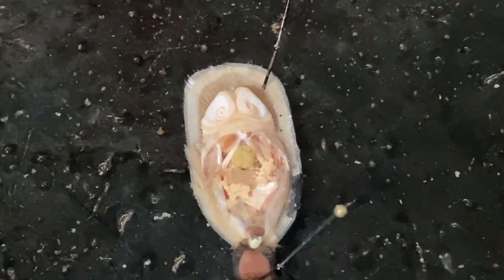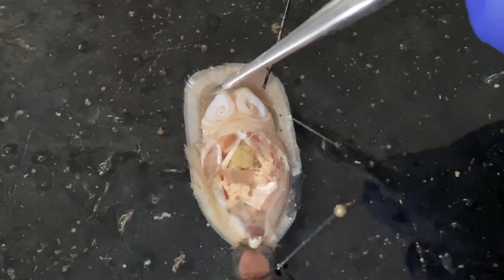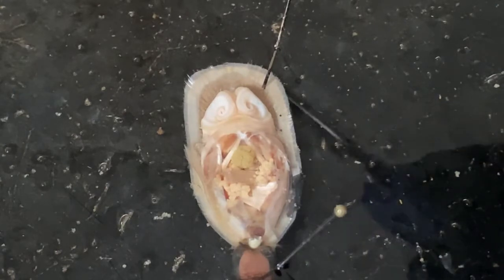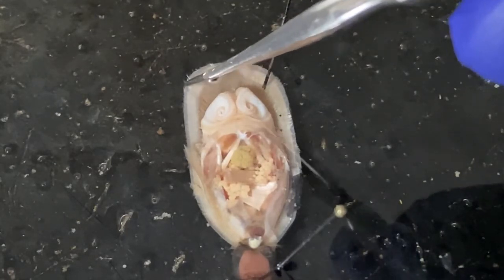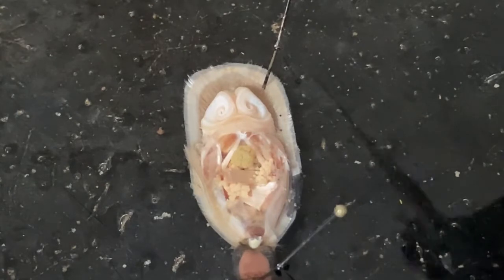Let's take a look at the internal anatomy of these animals. Now, these animals do have an internal cavity that houses the lophophore. And what you can see actually branching out, these little extensions down in here, are extensions of the coelom that line the inner surface of the shell. The margin of the shell, we can see right here, and a few of the chaetae that I referred to earlier on. These chaetae are designed to keep large particles out so that only the small ones can get in. Those are the ones that they're going to capture.